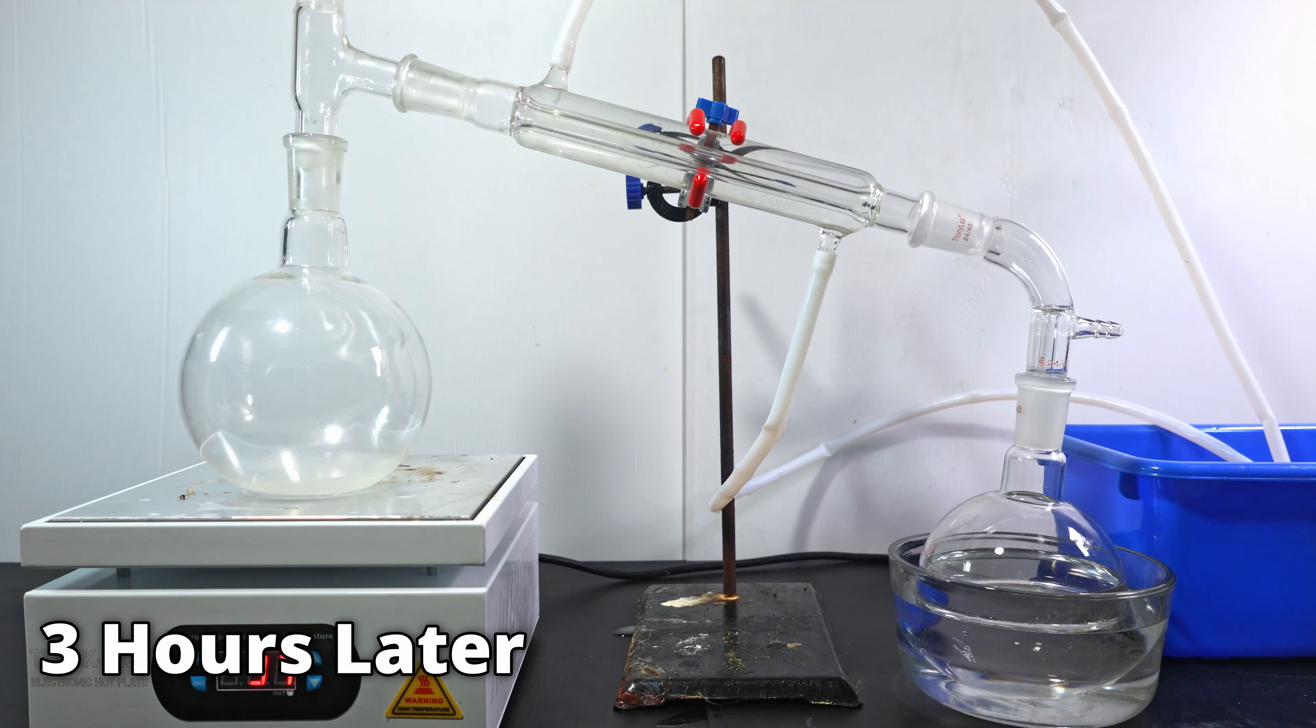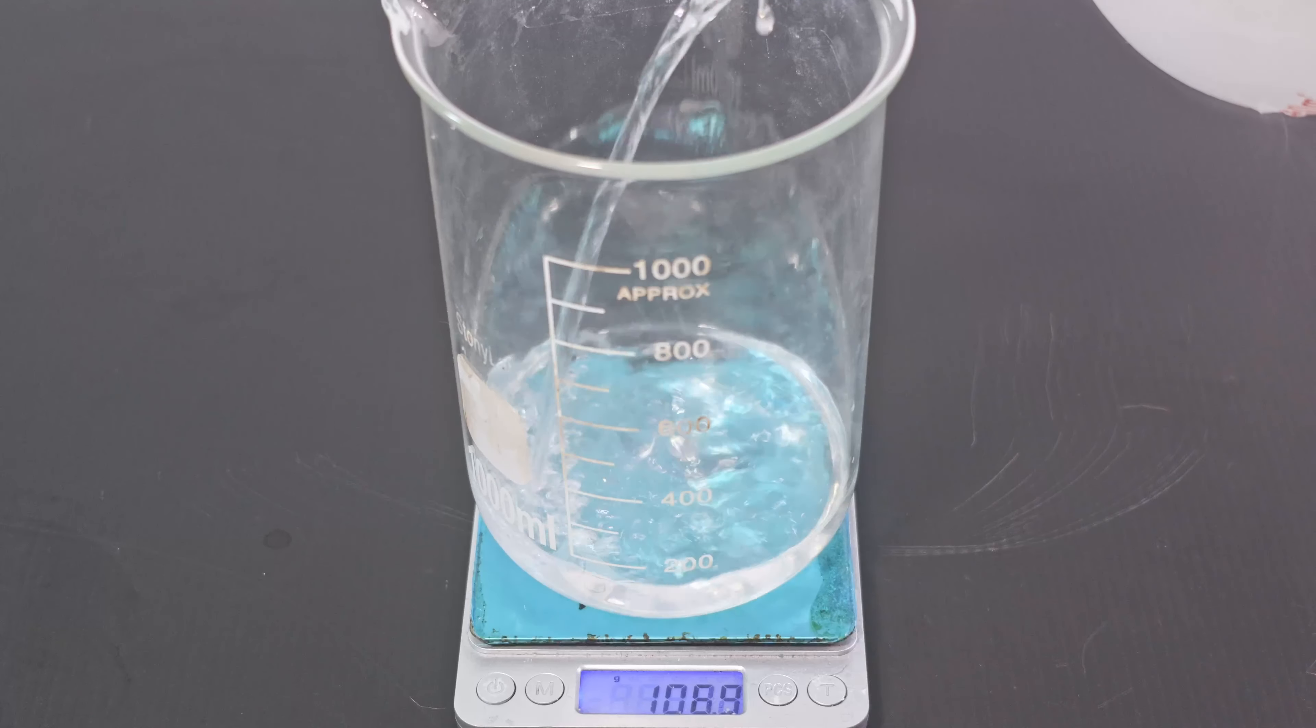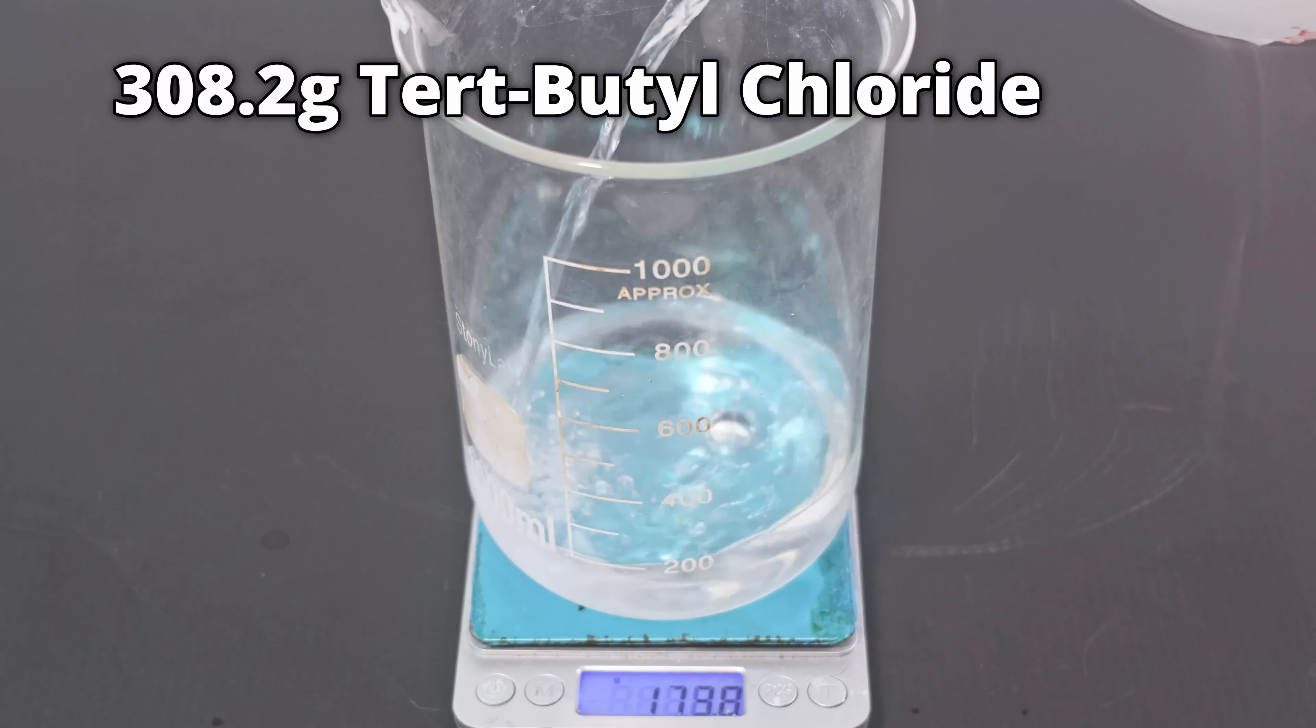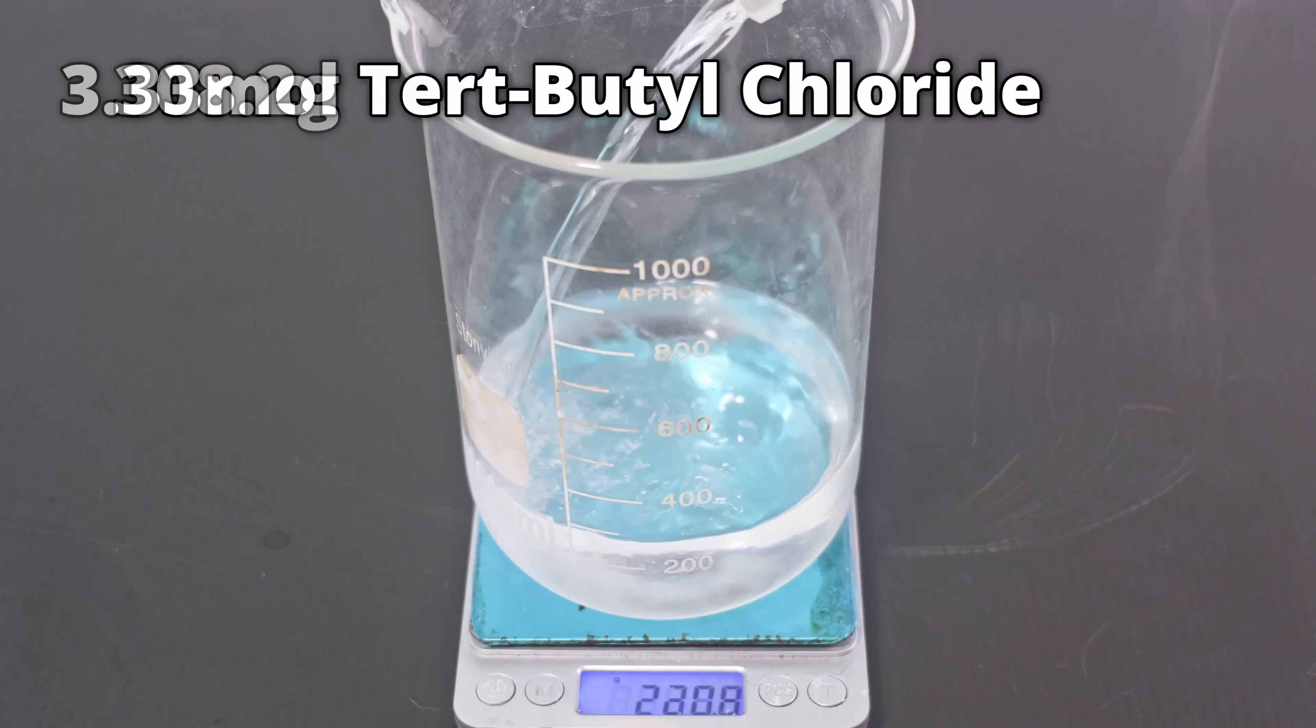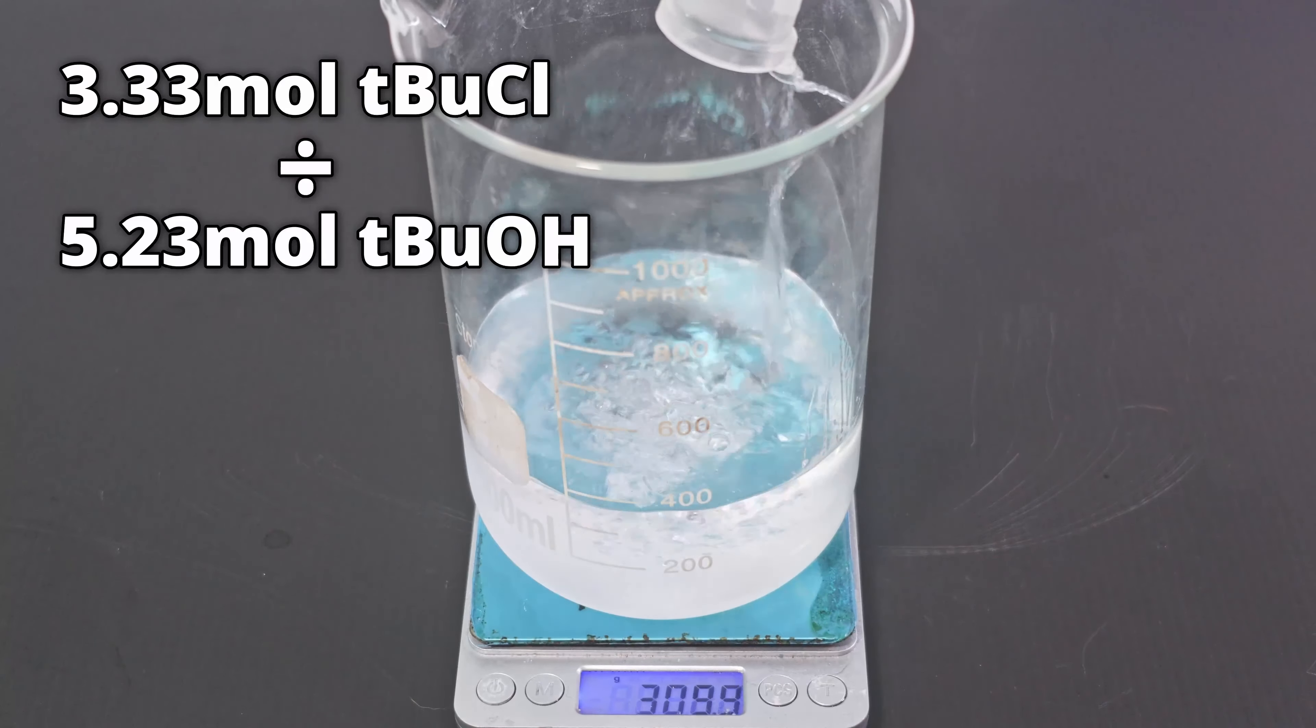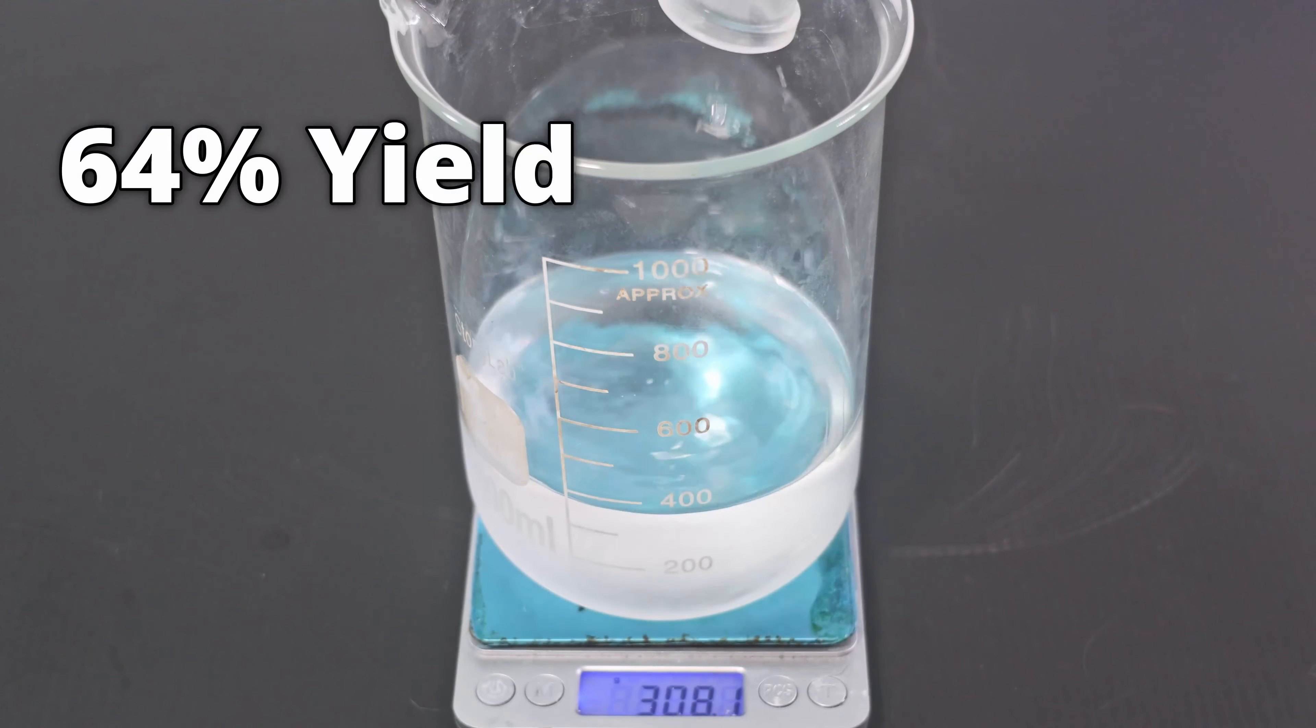Three hours later, the distillation is done. In total, I collected 308.2 grams of tert-butyl chloride. This is approximately 3.33 moles of tert-butyl chloride. With respect to the tert-butanol I used, I got a 64% yield.